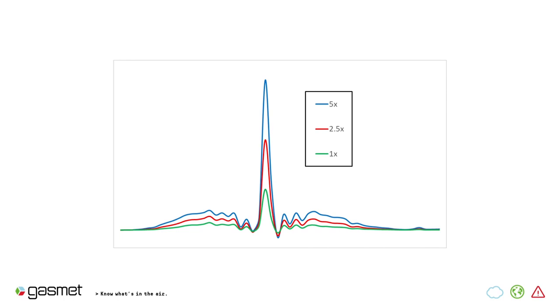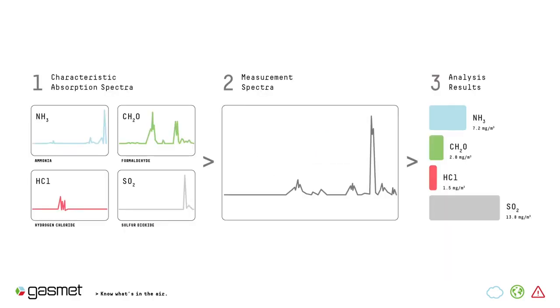And there's more. When light is traveling through material, the amount of absorption depends on the concentration of the material. This is known as the Beer-Lambert Law. Here we can see a part of the infrared spectrum of methane with 3 different concentrations. This means that if we have infrared spectra of known compounds in known different concentrations, we can determine how much of them there is in the sample. So in practice, we have the sample, and we have spectra of different compounds in different concentrations. Then we compare the sample to these different spectra, and we try to find a combination that fits the sample. This gives us the information of what compounds there are in the sample and how much.